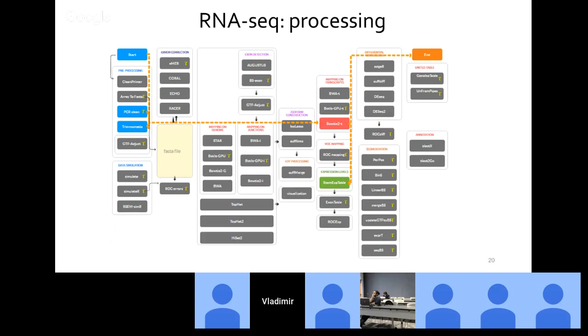For example, in case of analyzing short sequencing, microRNAs as an example, identical reads emerge from biological origin of the analysis. So in some cases, PCR duplicates removal can even introduce bias to the result.